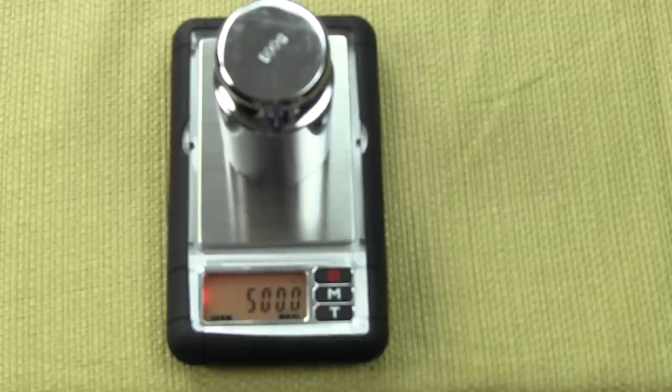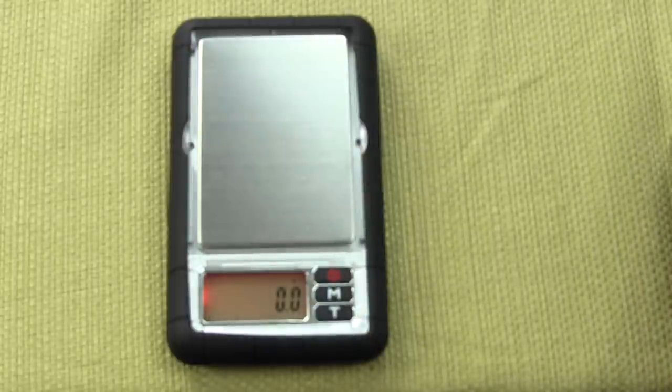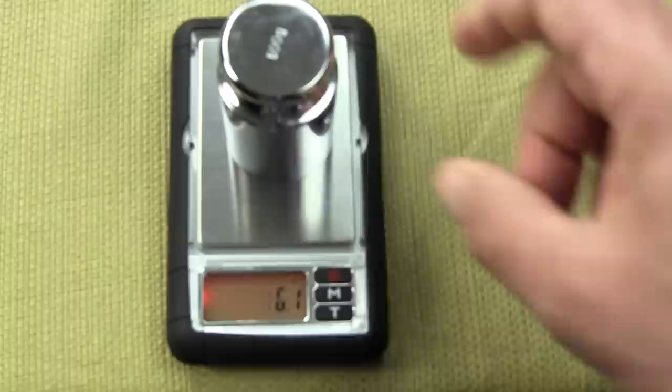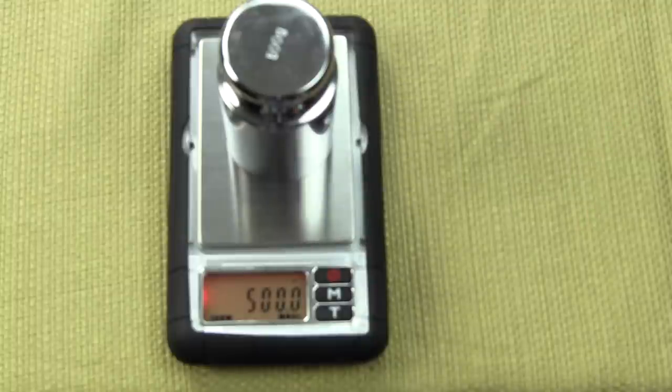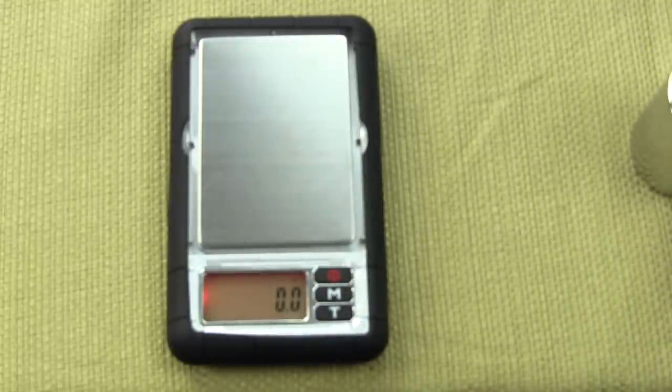The scale will show pass and it will return to the active weighing mode. As you can see, it is extremely simple to calibrate the MyWeigh Dura scale D 600 gram scale, but it does require a 500 gram mass.